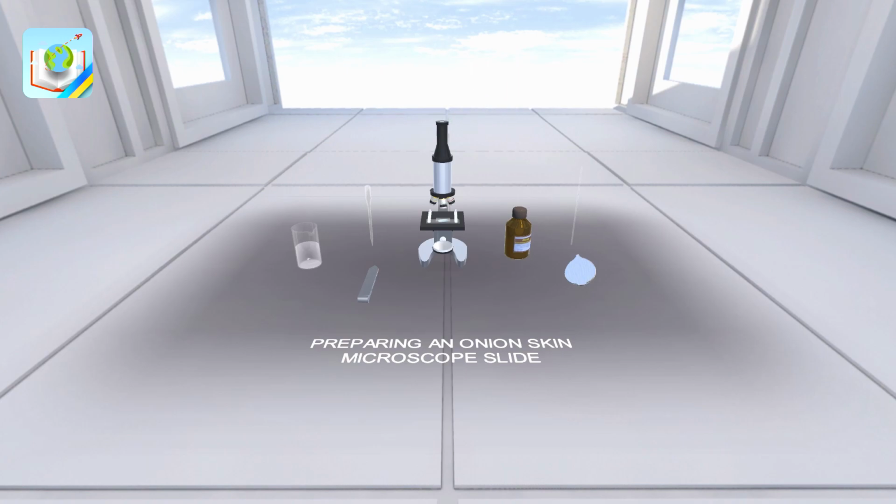We begin to stain the microscope slide with iodine solution. We take a drop of iodine solution with a glass rod and apply it onto the microscope slide of onion skin, along with a cover slip. Now we wait until the iodine gets under the glass.